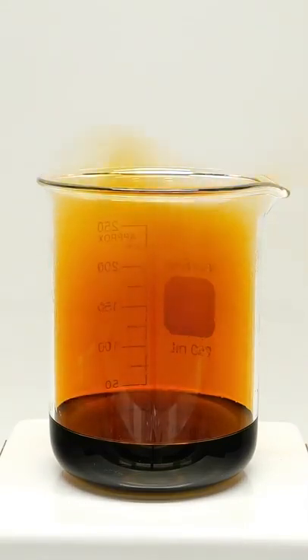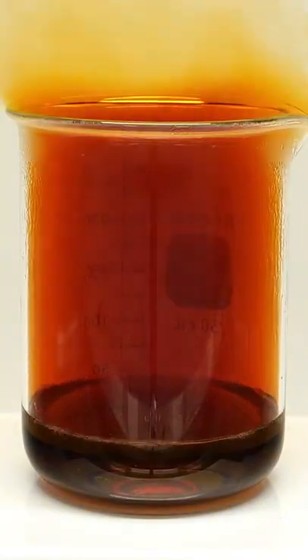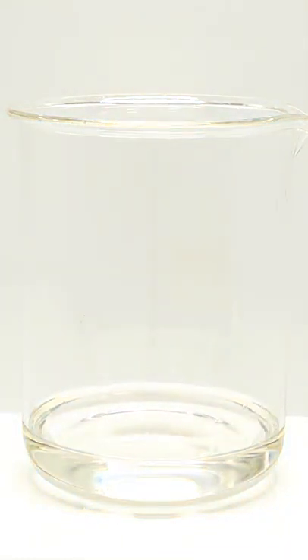After about 20 minutes, all of the mercury was gone. The reaction still wasn't quite done, though. So what I had to do next was turn on my hot plate and bring it to a boil. It ended up taking a lot longer than expected, but after almost an hour, it was completely colorless.